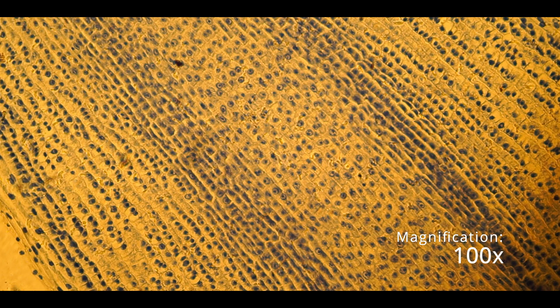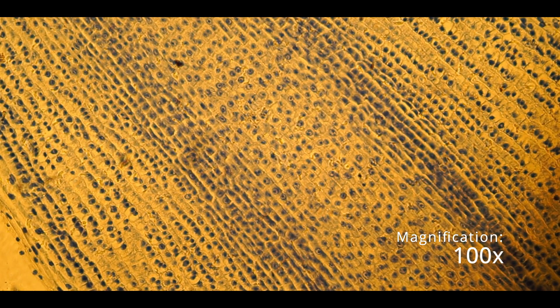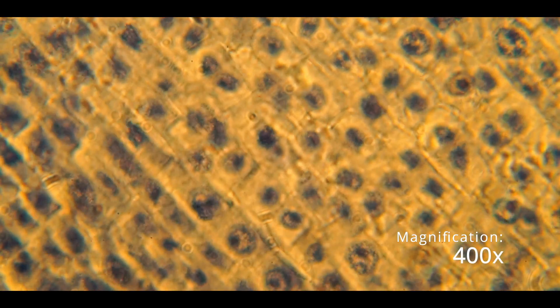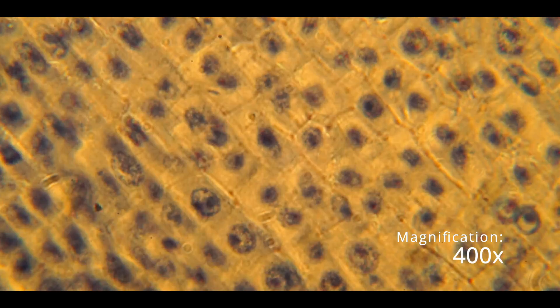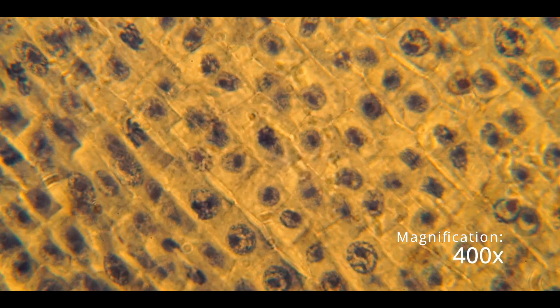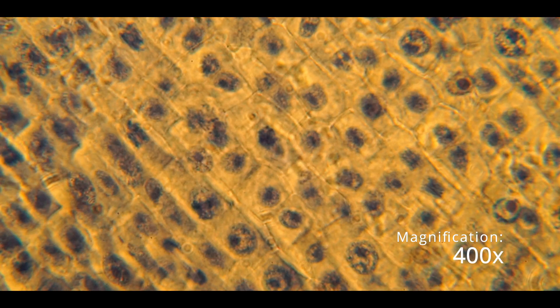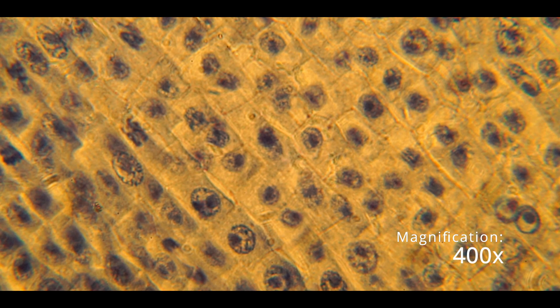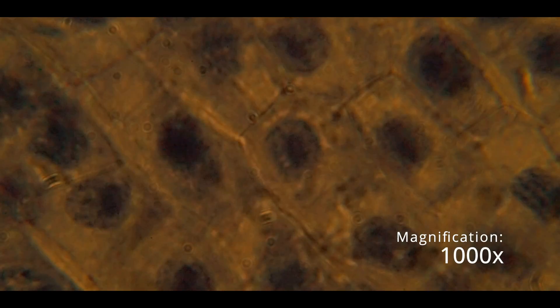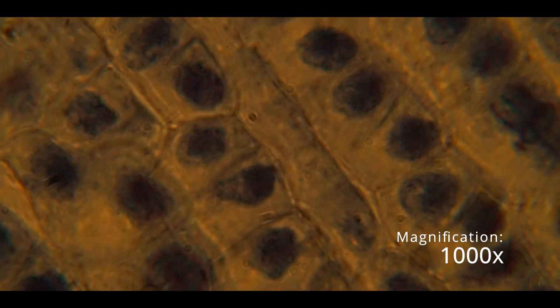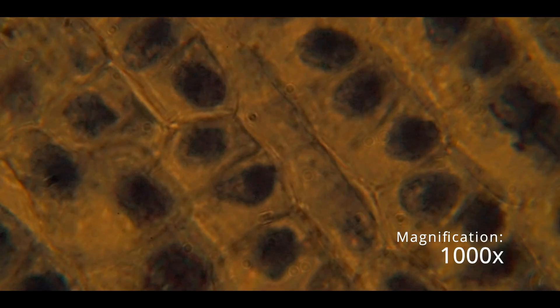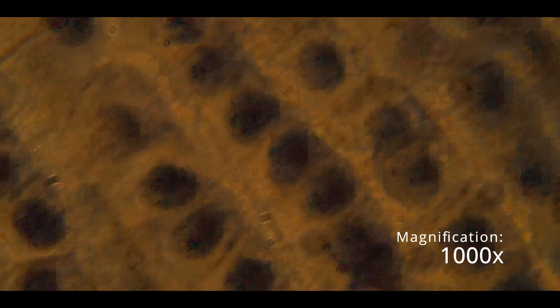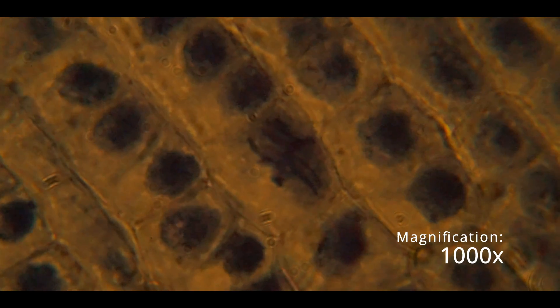Okay, so this is 100 times. Let's see if you can focus better there. 100 times. This is 400 times. Let's see if we can get it right. Okay, then we're going to try the oil immersion. Okay, so we're going to try the oil immersion. Okay.